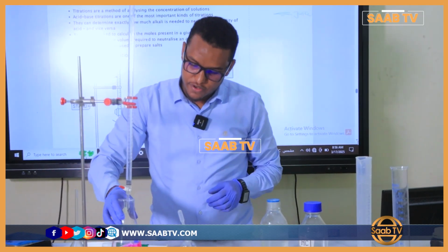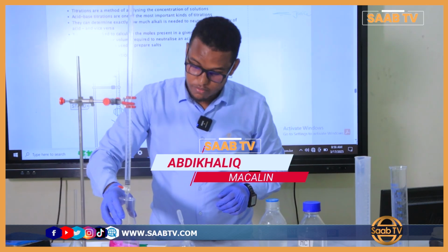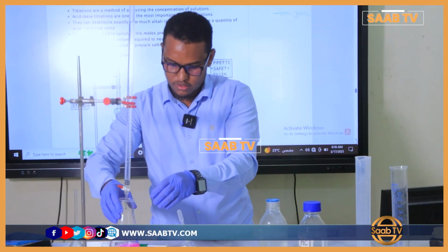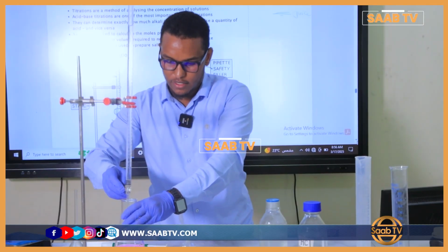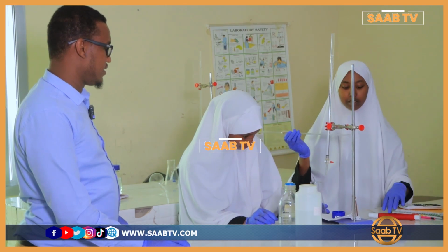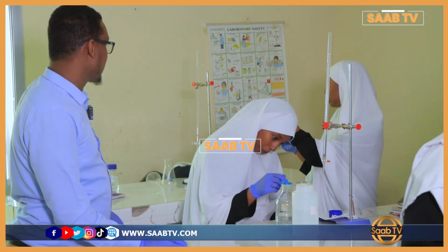And then we mix it very well. Let me observe when the color turns colorless. When the color turns a little bit, we go drop by drop. We have to go drop by drop. Look guys. Wow. The color turns colorless.